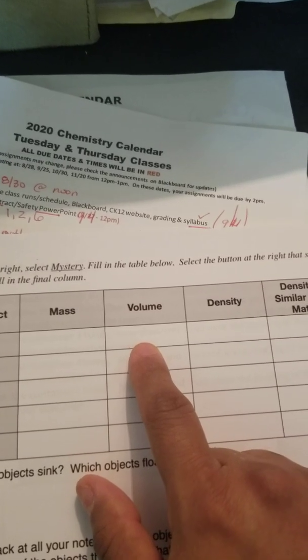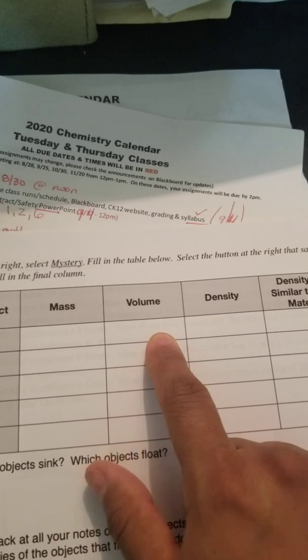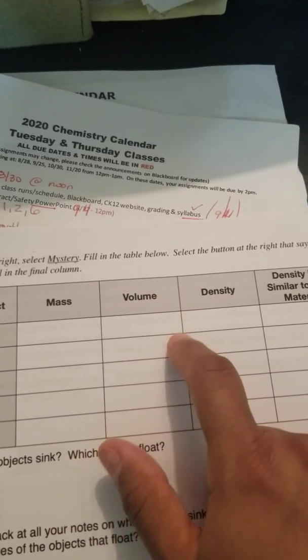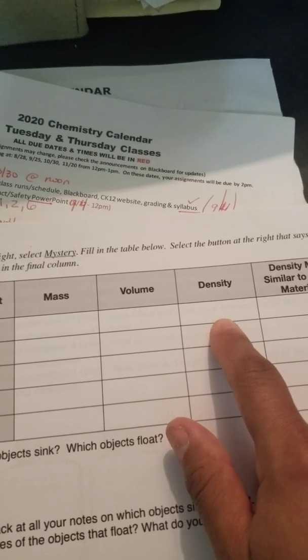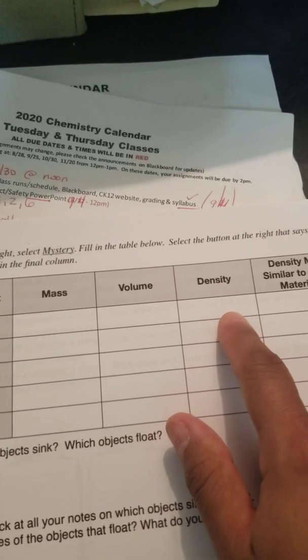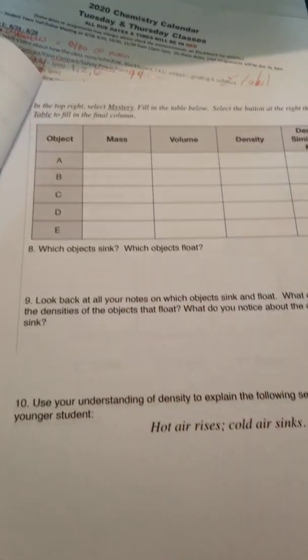By what we call water displacement. You get the new number, subtract the original number, and that math that you do is going to be the volume of that object. Find the density, which is mass divided by volume, and then it has a little question here. A couple of questions down here.